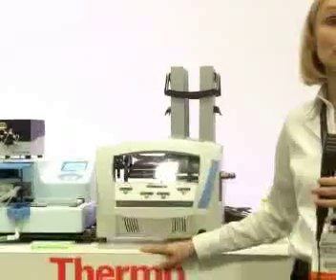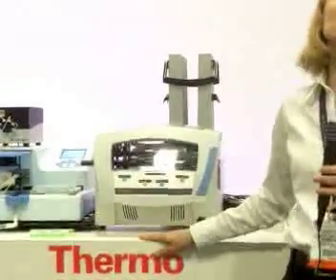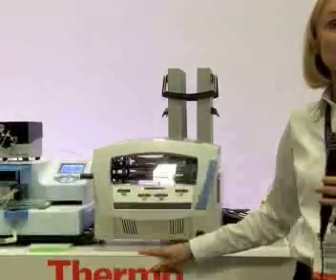And I also have a YouTube station where you can see the RapidStack with a multitude of Thermoscientific-branded products moving in action, and how you would set that up and use them. And that is the microplate stacking page on YouTube.